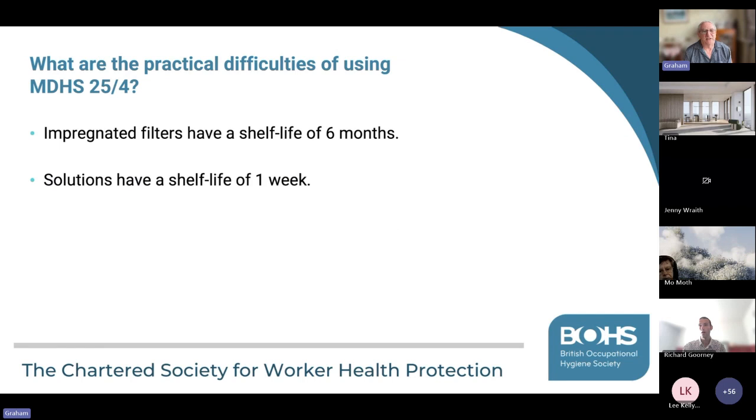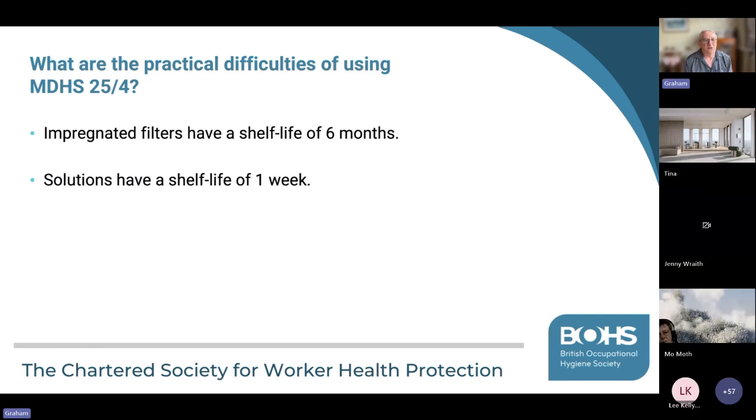So what are the practical difficulties of using MDHS 25.4? Well, the first thing to be aware of is that the impregnated filters, they have a shelf life of 6 months, but the solutions only have a shelf life of 1 week.